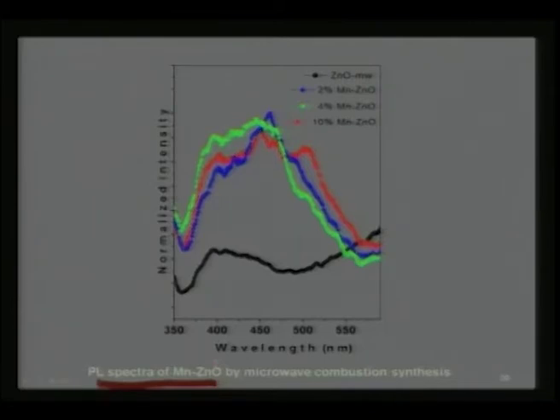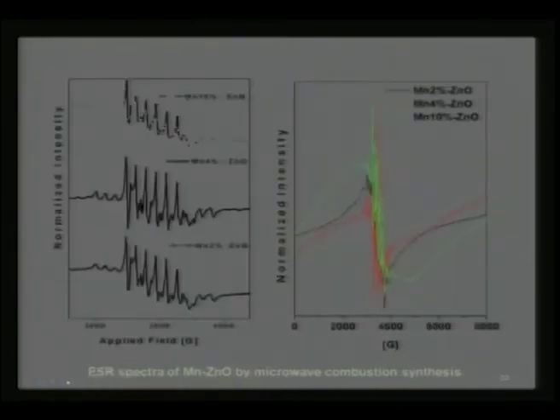Therefore, you do not see any band to band emission, edge emission, but you see defect induced or oxygen deficient PL behavior.